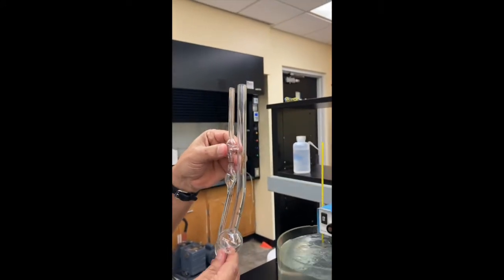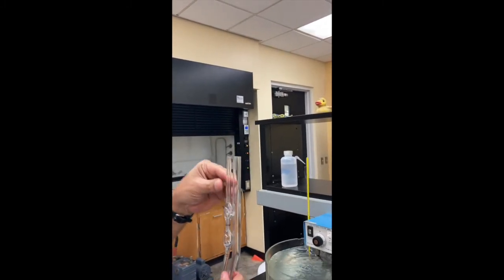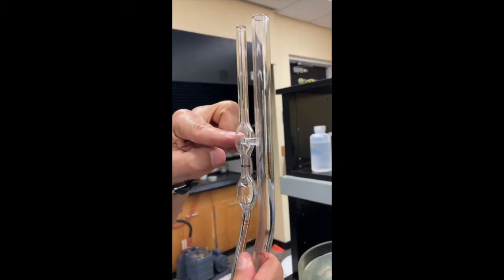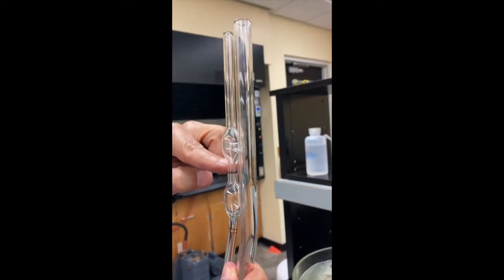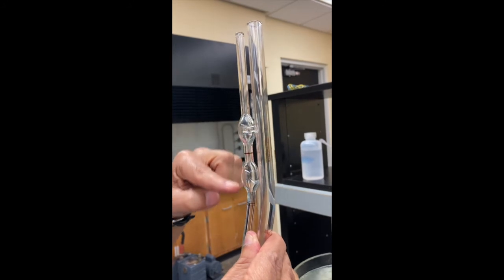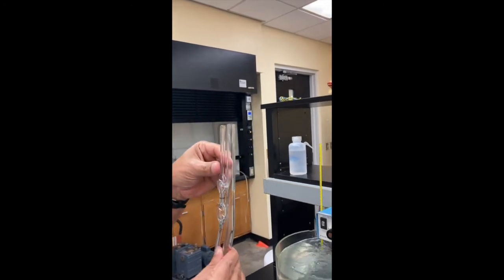So, how are measurements done? 10 milliliters of water or your solution of polymer is poured in this tube, and then a rubber bulb is used to suction this liquid above the upper fiducial mark. Then the bulb is released and the liquid starts to flow down. We measure the time it takes for the liquid to flow from the upper fiducial mark to the lower fiducial mark. The longer the time, the higher the viscosity; the shorter the time, the lower the viscosity. And that's how measurements are done.